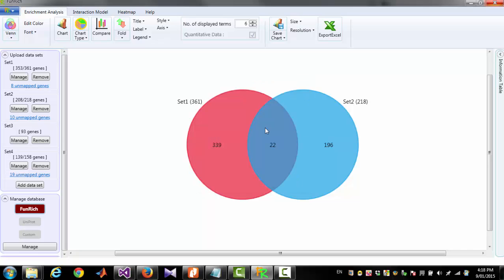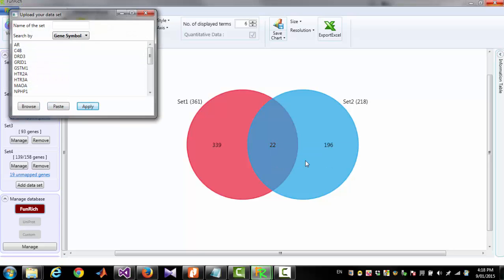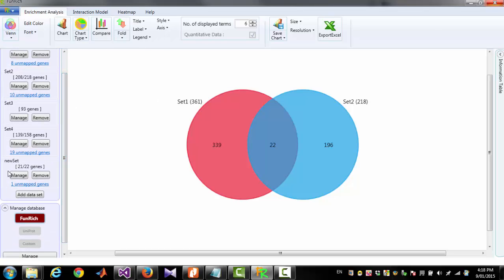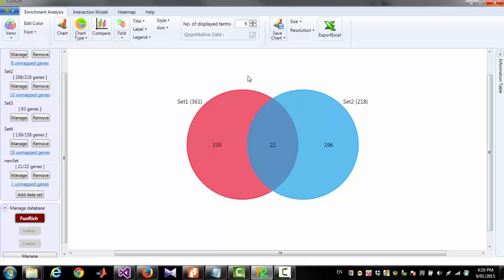You can also create another dataset from those 22 genes by clicking Use as New Input Gene Set. Now you can give a name New Set and click Apply. You will get a new dataset with those 22 genes. You can see out of those 22, 21 are detected and one is not detected.